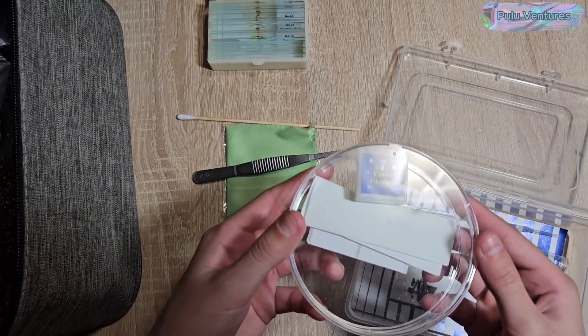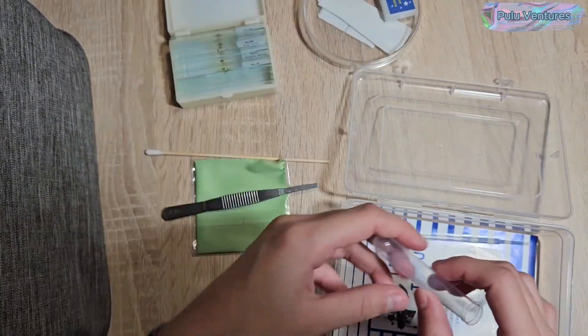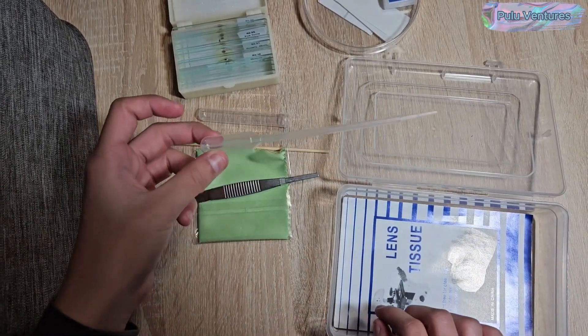Hello, we have purchased this microscope and we are going to see how it works. It comes in a very useful and protective case with the following accessories. The slides in four boxes were purchased separately.